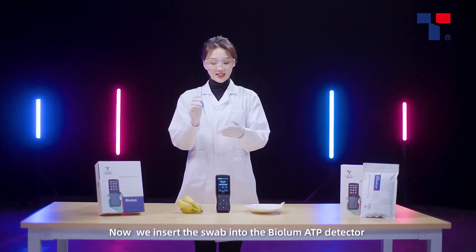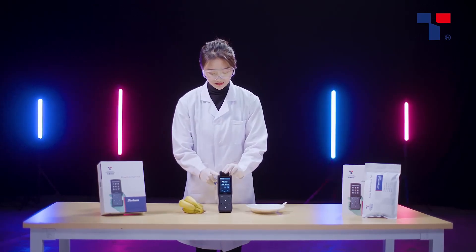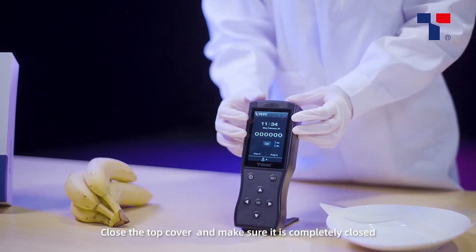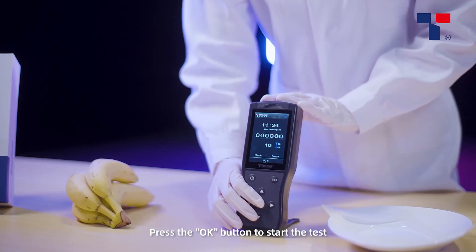Now, we insert the swab into the BioLume ATP detector. Close the top cover and make sure it is completely closed. Press the OK button to start the test.